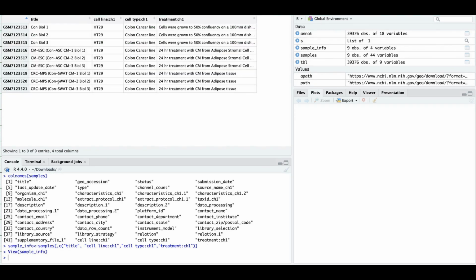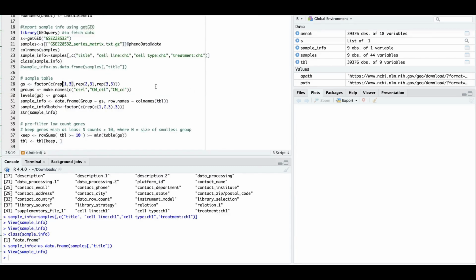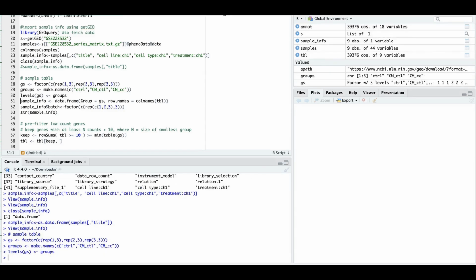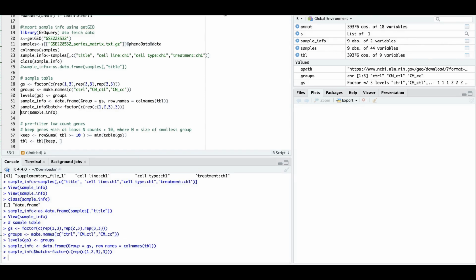And so this is the major group, the third one, and these are described as the two controls. Pay attention that in this particular case the column names are in a good order from 13 to 21. So here I partially inherited the way how it was made with Geo2R, because I need factor and group names, which I agree, and then I need levels, and then I also found the batch information and added to this sample file, simply declaring it.